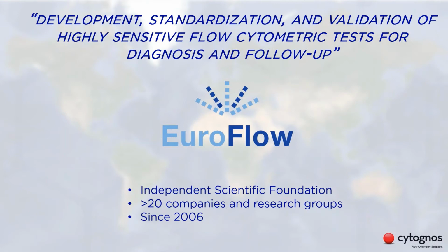The EuroFlow Group is an independent scientific foundation made up of over 20 companies and research groups, which was born in 2006 with the mission of developing, standardizing, and validating highly sensitive flow cytometry tests for diagnosis and follow-up.